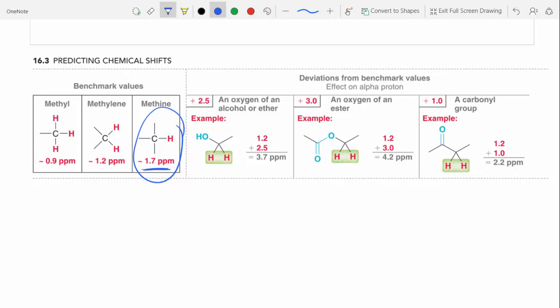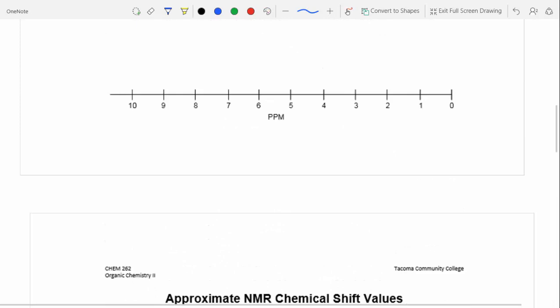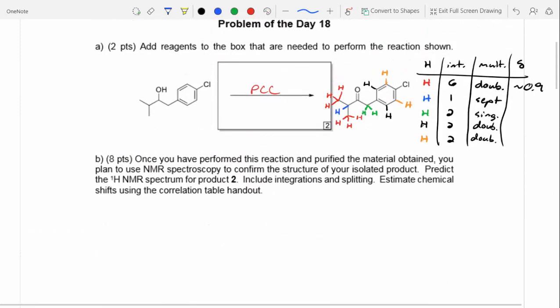However, let's go back up and look at it. For the blue protons, you guys notice that we have this carbonyl group right next to it? Those carbonyl groups are really electron withdrawing. So, do you think this will show up at a higher ppm or a lower ppm? Higher. It will be more downfield due to the inductive pulling by that carbonyl group.